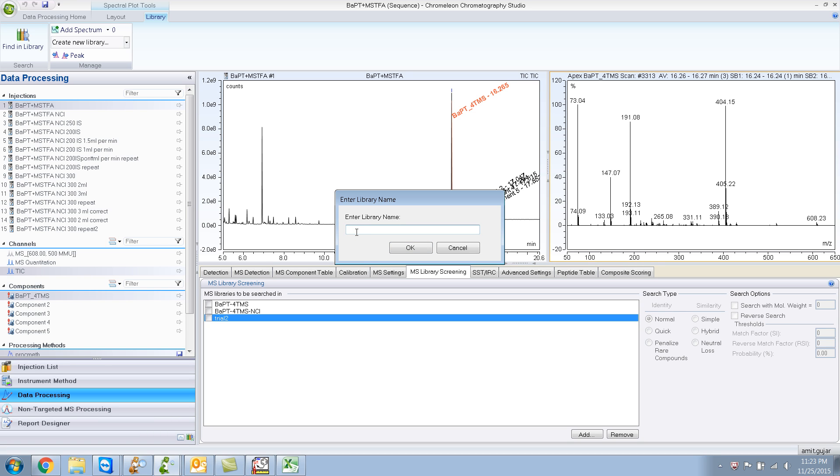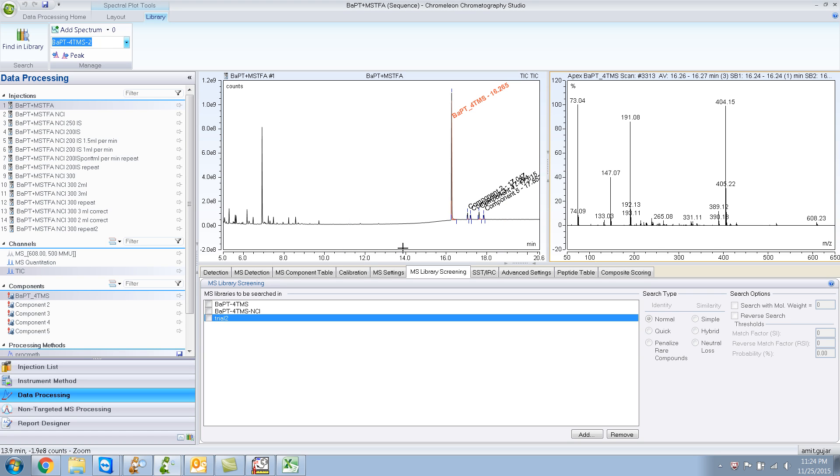Let me name this library as BAPT-4TMS. Or let me name it dash 2 because I already have dash 1. And I click OK. Now, this particular spectra is stored in that library called BAPT-4TMS-2.